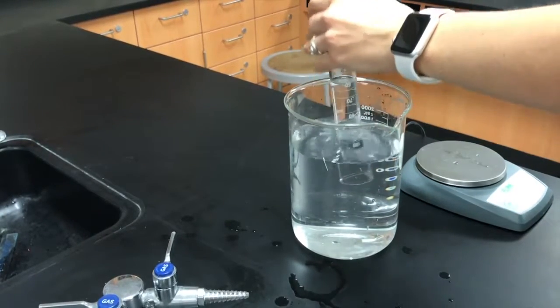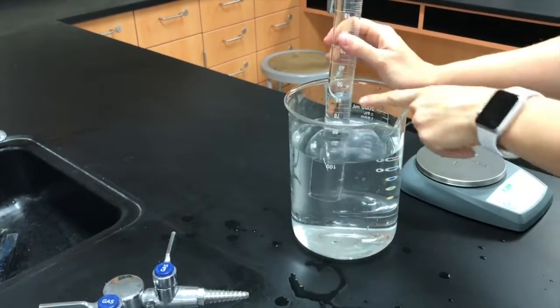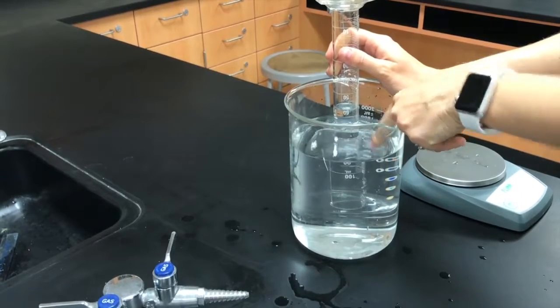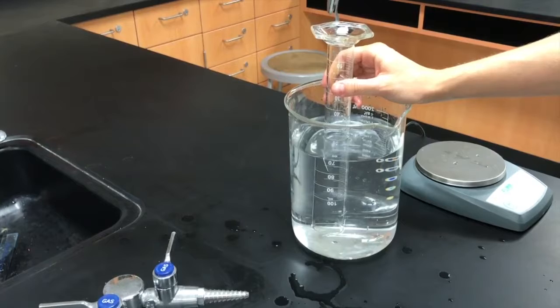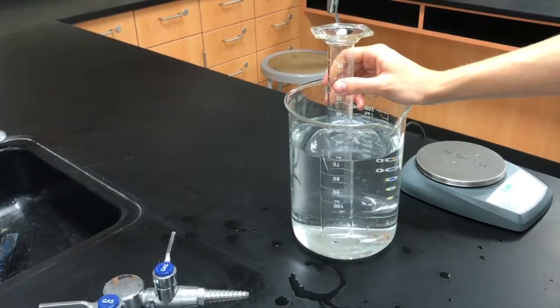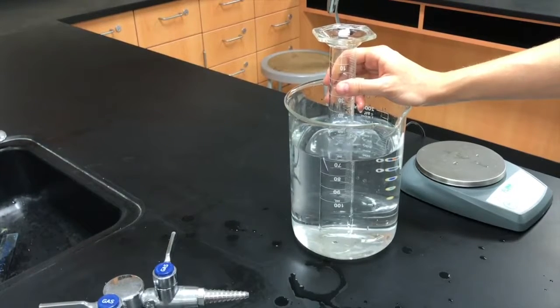Okay, now that I have 60 mL of my gas in there, notice the level of the water here is not equal to the level of the water here. And the reason why I want the level of the waters to be the same is when the levels of the water are the same, that means that the atmospheric pressure being experienced by the gas in the graduated cylinder is going to be equal to the atmospheric pressure out here. And the atmospheric pressure out here is what we're actually able to measure.